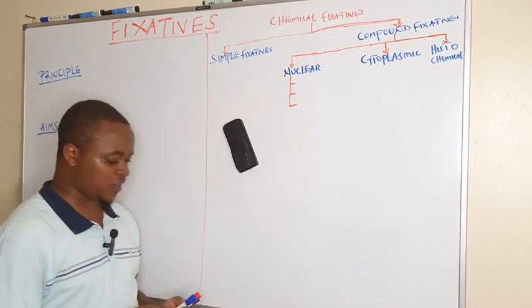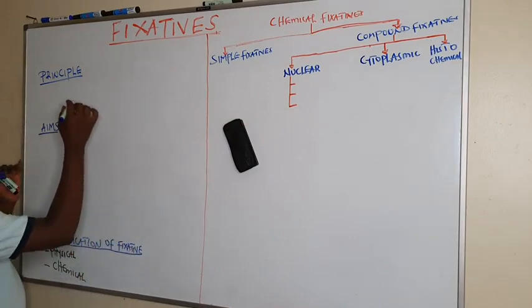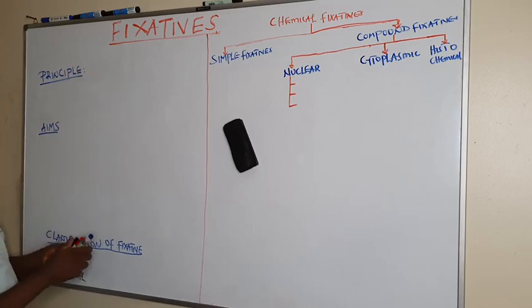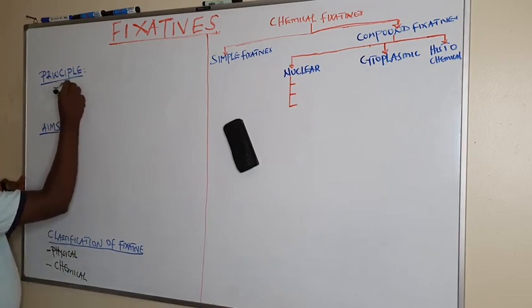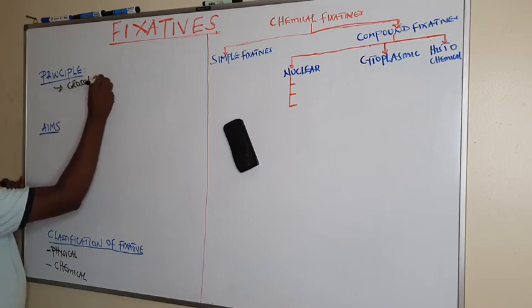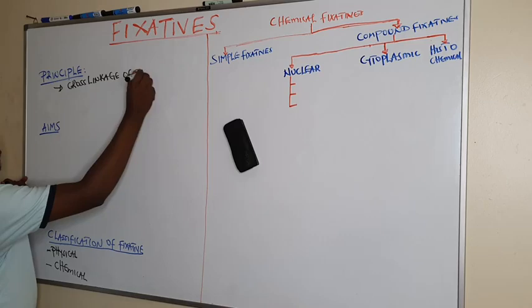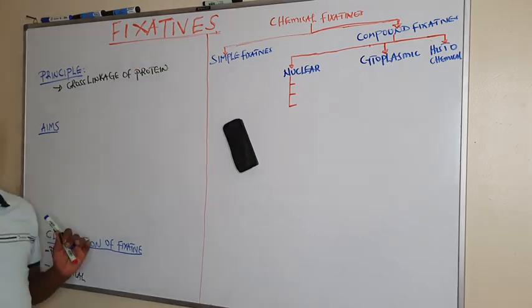And these fixatives work under a principle whereby some act by formation of cross-linkage of proteins to form a three-dimensional structure.